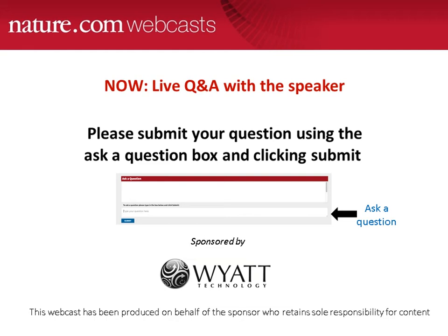Excellent, thanks, Eva. And I think we've got time for just one last question. And this one starts off by saying, the KD of dimers can only be determined for fast reversible equilibrium complexes, and that's not the case for all complexes. Is there a way to determine KD for other complexes by SEC-MALS?